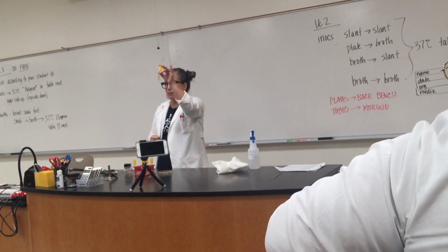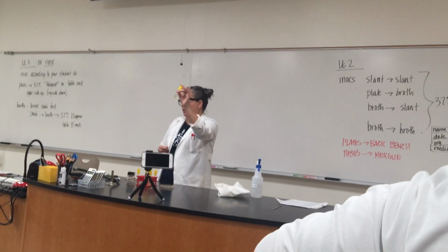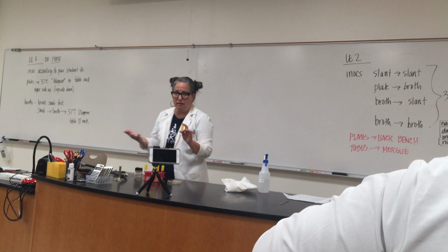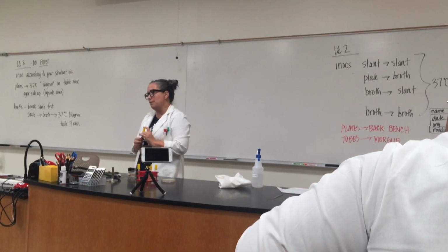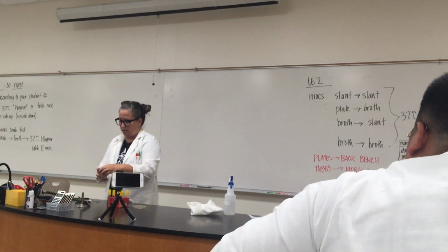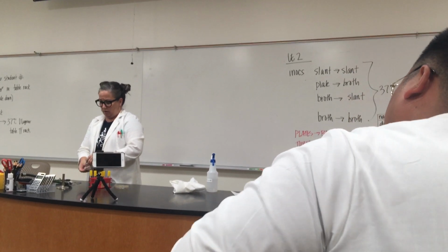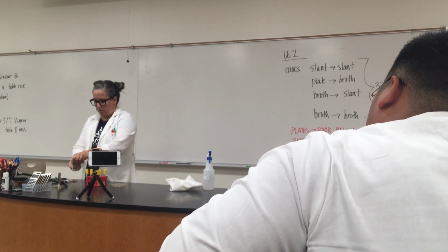So tubes upright, right? Why am I saying this? You think it's because I don't know any better, but I'm telling you, after doing this for 40 semesters, statistically, people always turn it sideways and dump the bacteria onto themselves. So there are some little tiny rubber bands back there. There are not many, right? They run out quick. But make sure everything is labeled, and when you're clean, you're good to go.